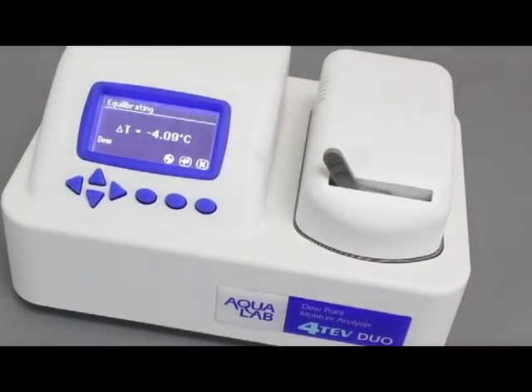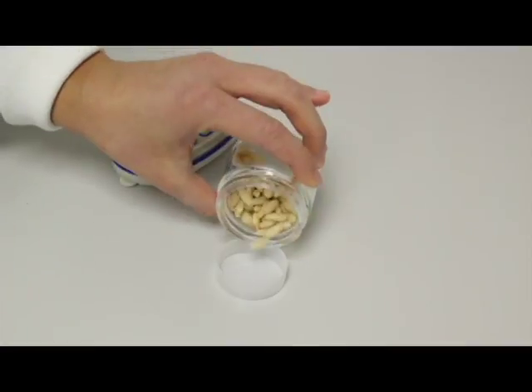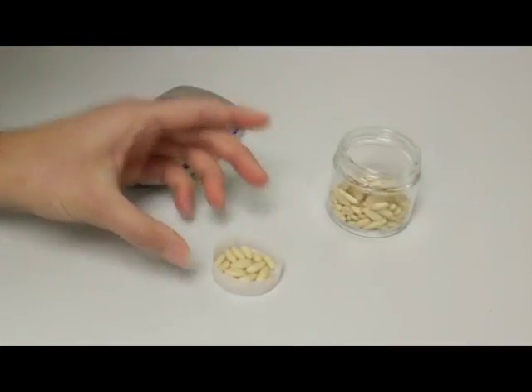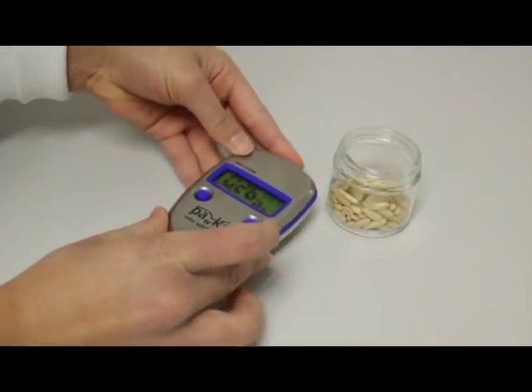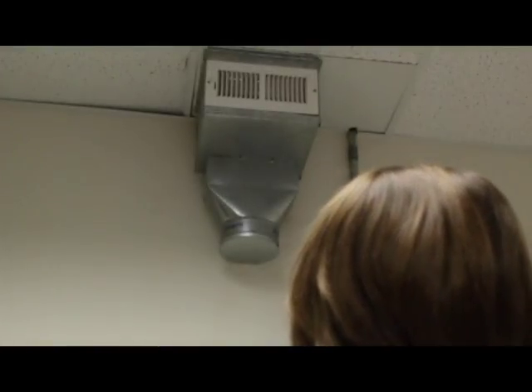These instruments also have temperature equilibration, which the pocket and light do not have. Since water activity is temperature dependent, taking readings at a consistent starting temperature is extremely important. If both the instrument and the sample are at ambient temperature, then you shouldn't have any problems. If the temperature of your facility changes frequently, then you could have problems with temperature.